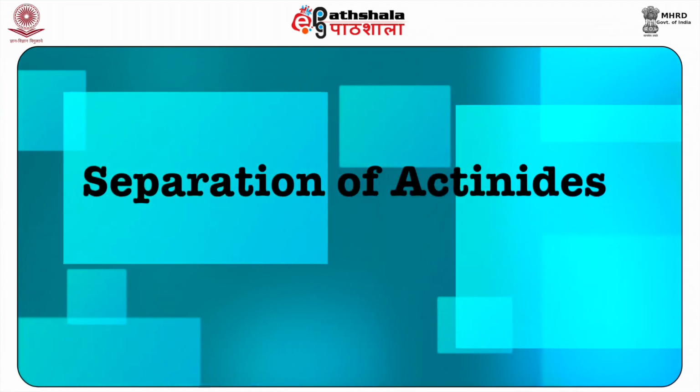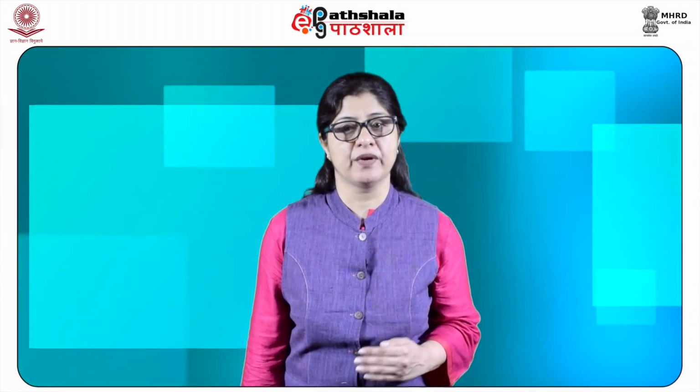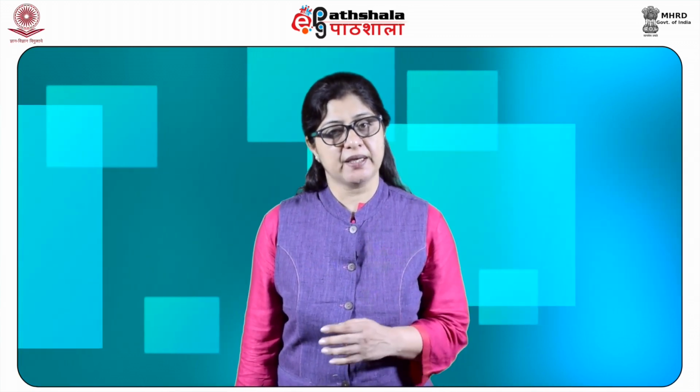Separation of actinides. The ion exchange chromatographic technique has played a unique role in the discovery of trans-plutonium elements in the actinide series. In the actinide series, the elution occurs in the reverse order of the atomic number due to the actinide contraction, and this proved to be the only way for identifying these elements. Some of them having been produced only in atom quantities. It may be said that their isolation would have been impossible by any other separation method.